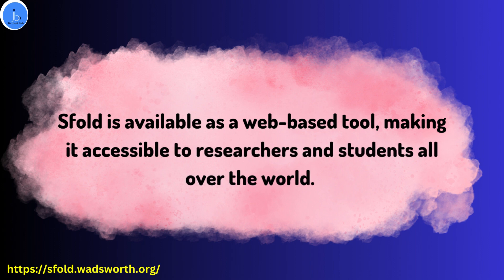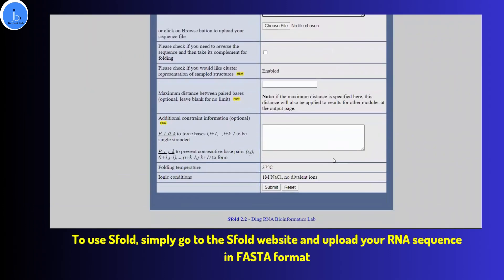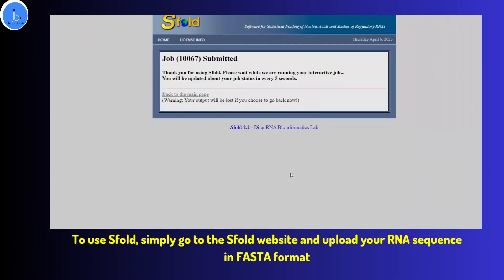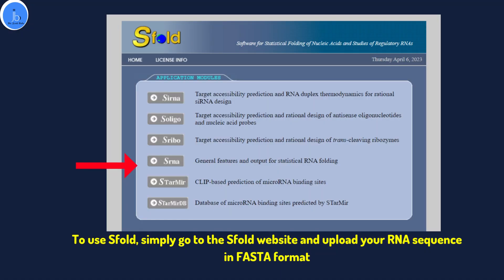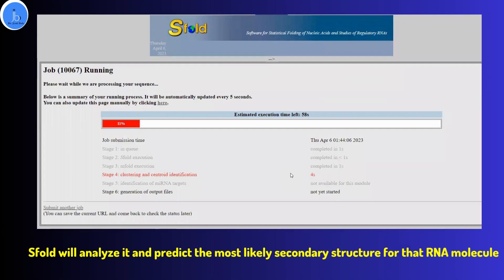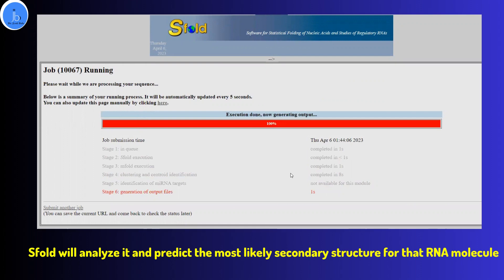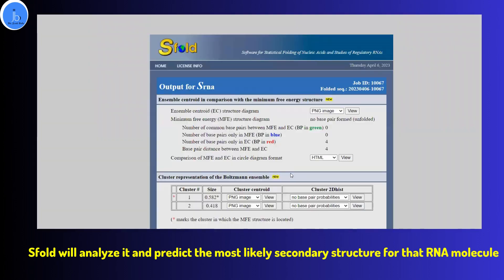To use S4, simply go to the S4 website, upload your RNA sequences in FASTA format. Please remember that S4 has multiple subsections for different tools and different analyses. Very specifically in S4 you have to go to sRNA. Once you have uploaded your sequences, S4 will analyze them and predict the most likely secondary structure. This is the kind of result you will be going to get.